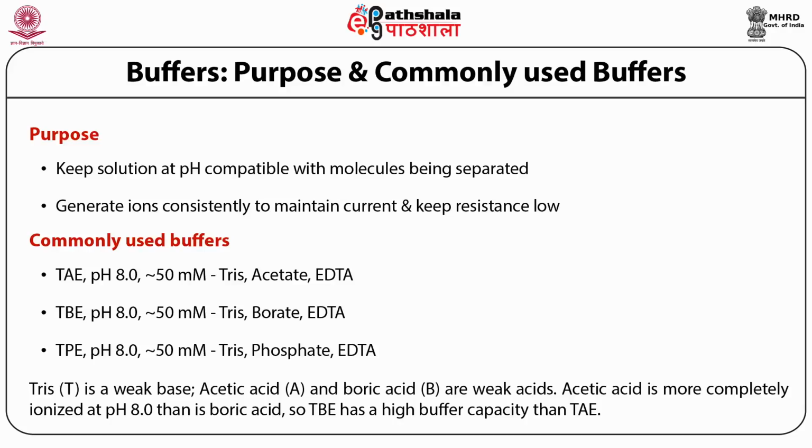As per the molecular size, buffer species having a high molecular size move slowly in electrophoresis. Tris is therefore preferred as it moves slower than chloride or phosphate because of its increased size and low charge to mass ratio, which significantly inhibits the buffer depletion.